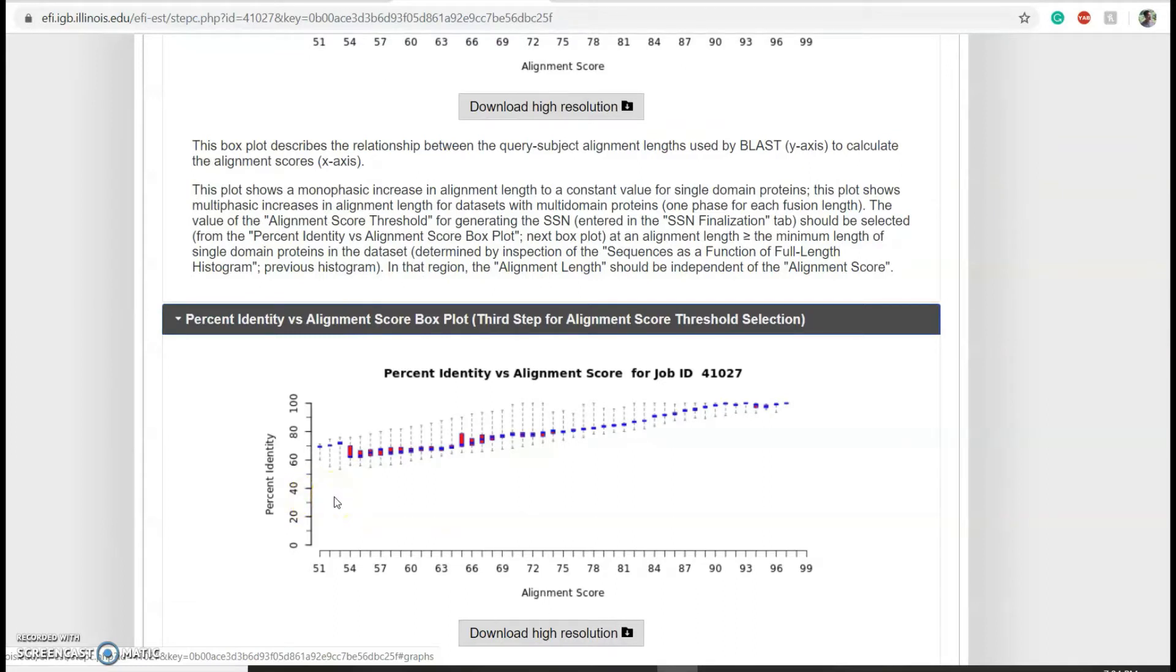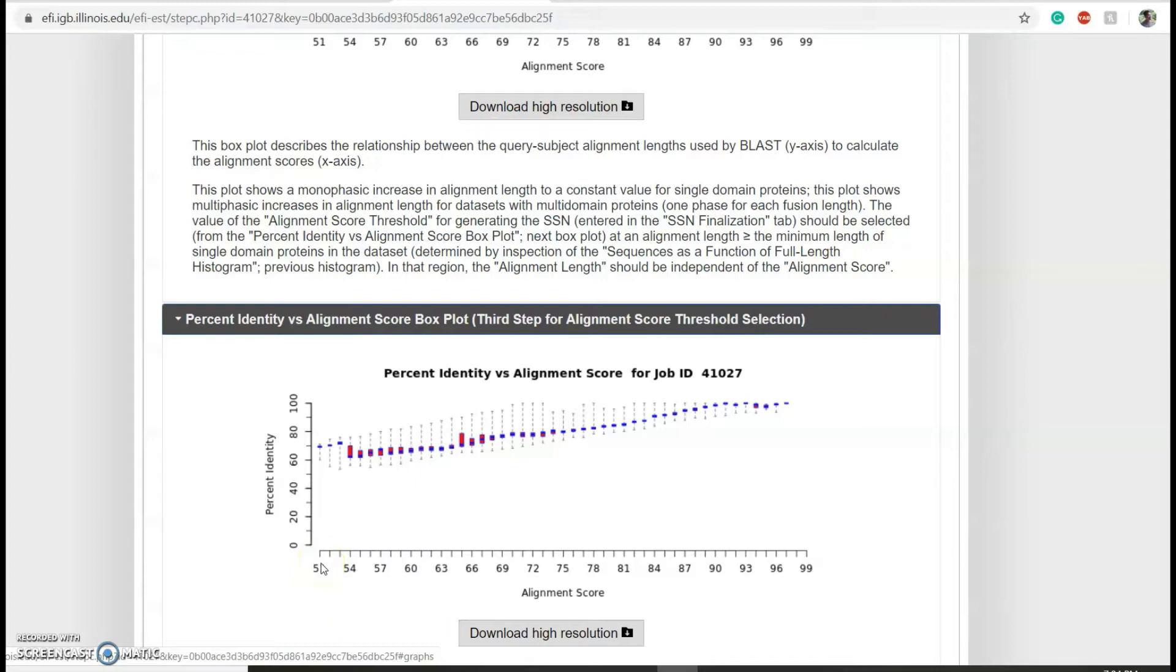As you can see, all our points are above that 35 percent threshold, so we can pick the least alignment score which is 51. Don't worry too much about picking the alignment score because in downstream processes you can always increase it if you want, or if you want it lower you can resubmit a new analysis. Once you've figured out your alignment score, click on SSN finalization.